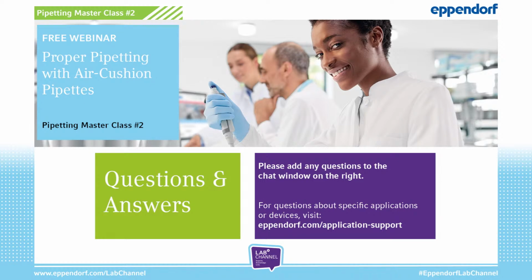Okay. So yeah, in the video, it was explained with a 2-button pipette. That's right. But when you compare, the performance of a 1 or 2-button pipette is not different from each other. So I think the use of a 1-button or 2-button pipette is actually personal preference. What you may want to consider when choosing the pipette is that a 1-button pipette comes with a lower risk of contamination. Here, think about the aerosols, which we also covered in this webinar.